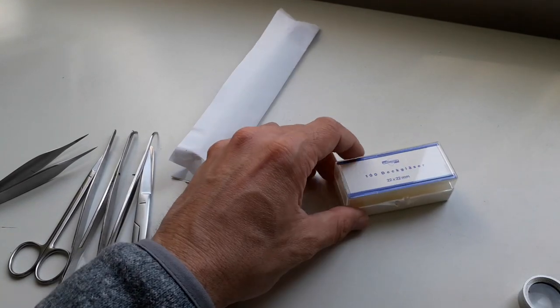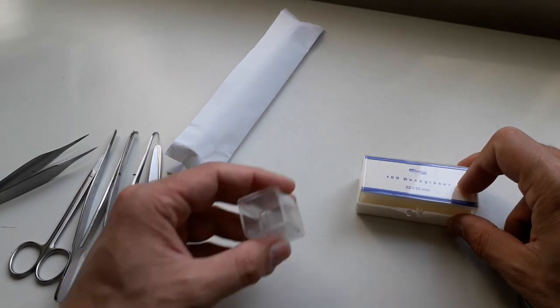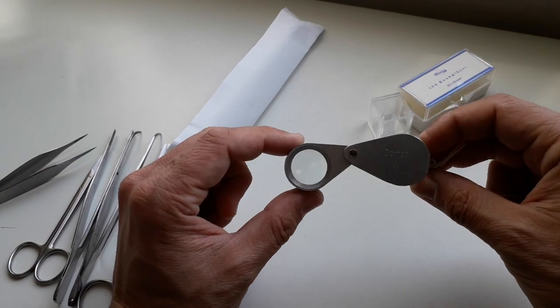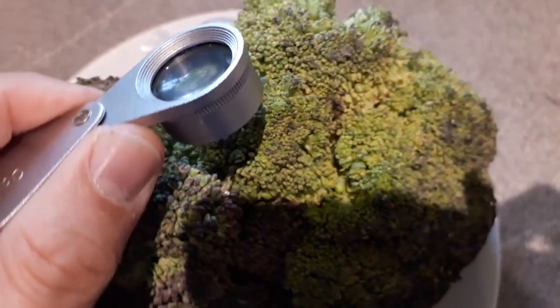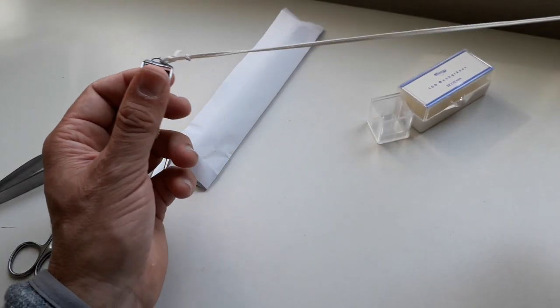Of course, some cover glasses, that's kind of obvious. These are a little bit larger that I have here. I've got some smaller ones here as well. I occasionally also use this magnifying glass when I'm in nature, simply to check certain specimens, whether there's actually something there worth collecting. I sometimes do a very quick check using this 10 times magnifying lens.